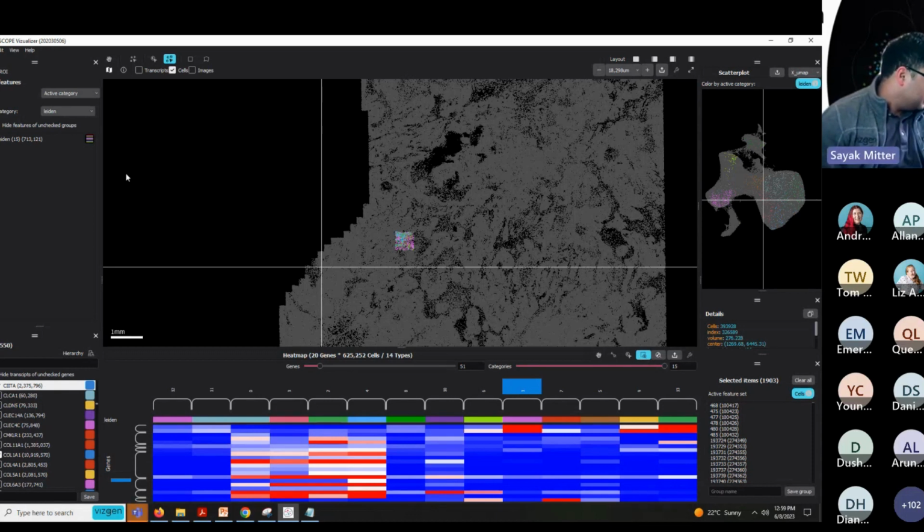I used VPT to resegment my cells, but the output files did not include a cell boundary. So the cell boundary parquet file, yeah, maybe we can take this and discuss this offline. Perhaps if you can send me an email, Cameron, and we can discuss this to see why the cell boundary parquet file was not generated after VPT. But there should be a way to do this.